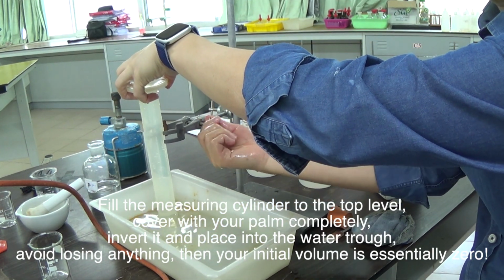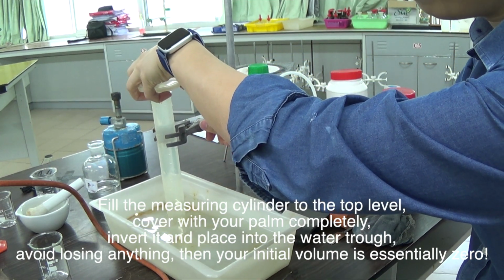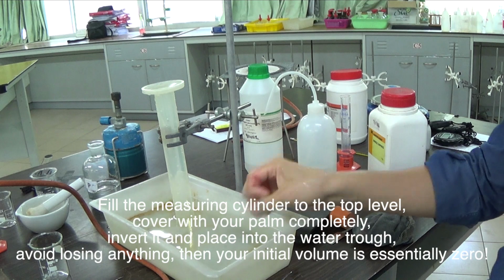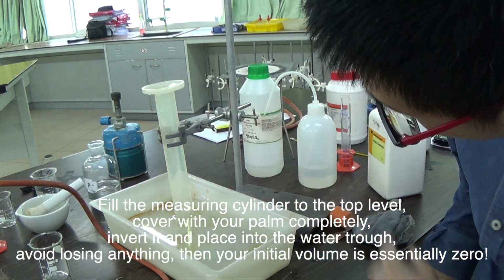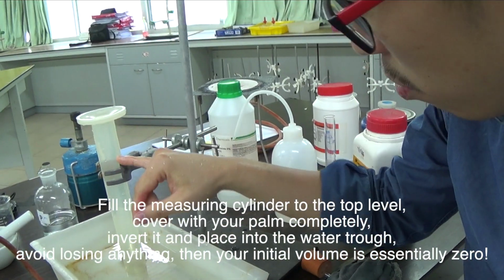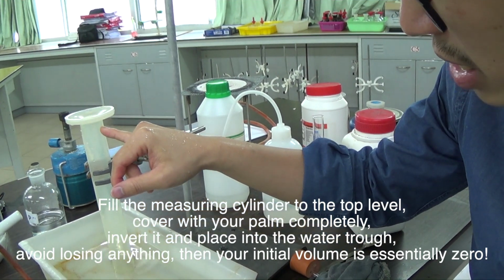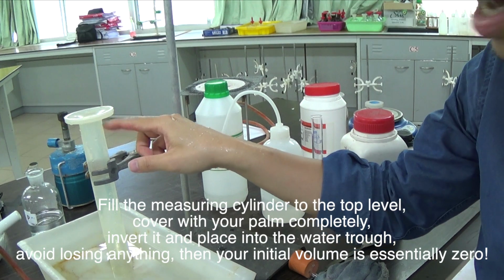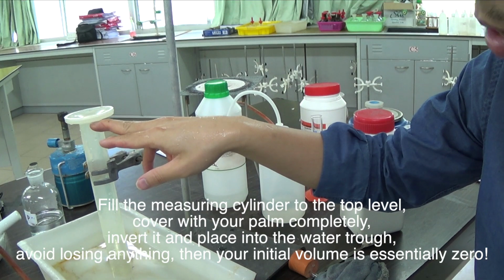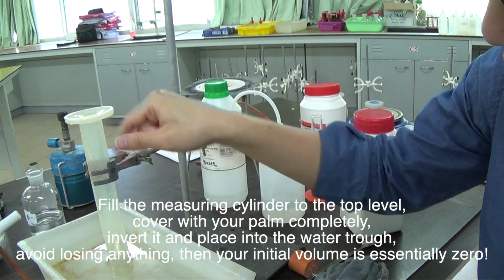You might have to do this a couple of times until you get it right. Do not lift this up all the way, because if you do, all the water will come back down. You see, I've got an air bubble there, so that's not entirely ideal, but most of it is the water that filled up previously. So this is still quite a good setup, because the level reads 0 cm cubed, starting from the very top here. But if you have lost a bit of water, then it won't read 0, because this level will be slightly lower as you lost some water in there.